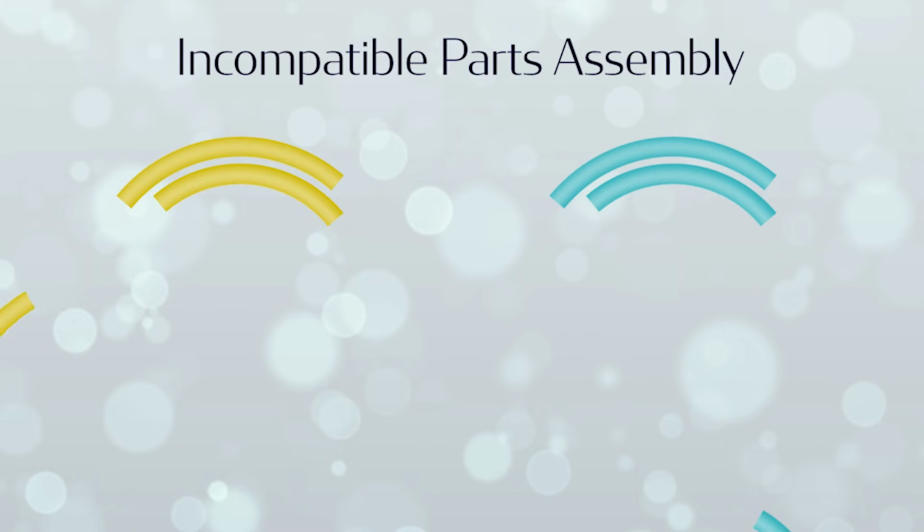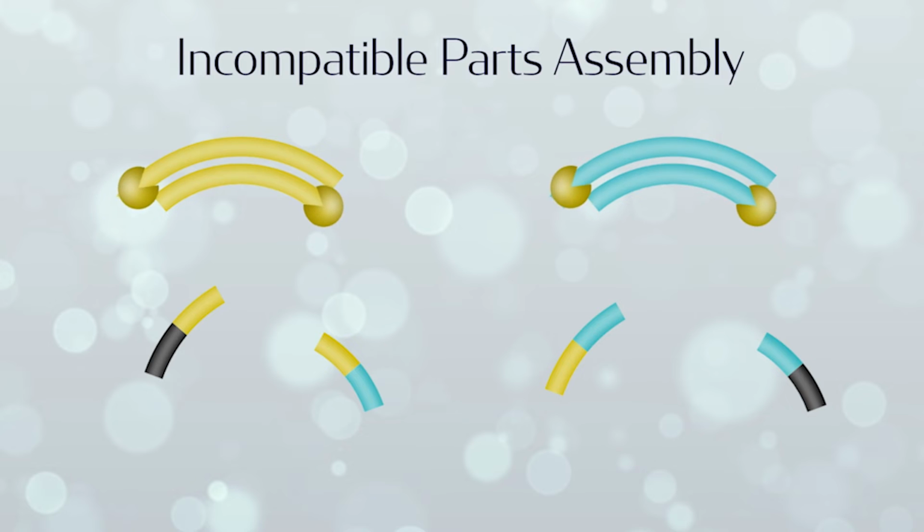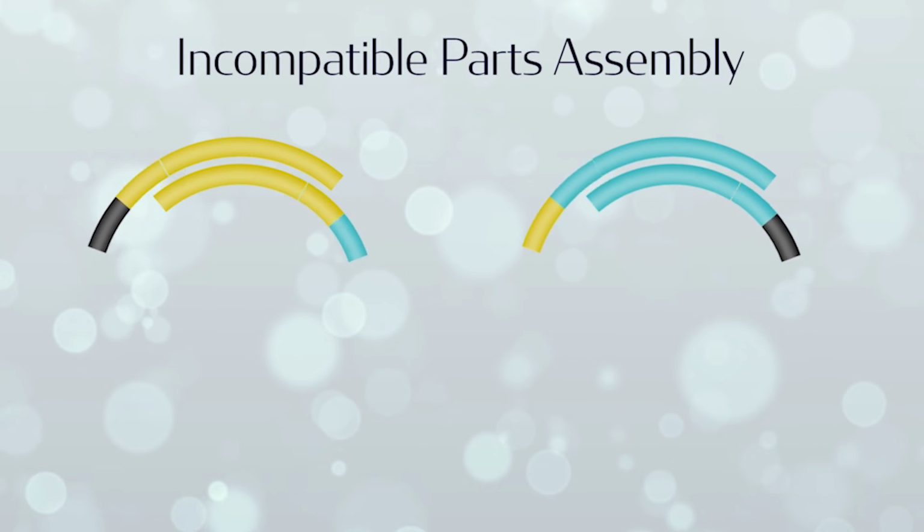Here, the designed DNA oligos with homologous sequences are added to the reaction. Extra oligos are added to merge the multiple desired Golden Gate parts or even PCR-derived sequences. The 5' exonuclease chews back the 5' ends so the oligos can anneal. Afterwards, the DNA polymerase fills up the nucleotide gaps and the added oligo becomes double-stranded.